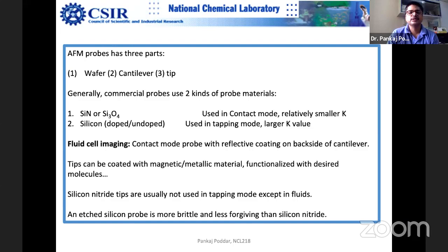As I told you, these probes are manufactured in silicon fab labs on large wafers. You know the wafers, silicon wafers you might have seen. They are circular discs and they come in different diameters. And on one side there is a linear cut, and you know the significance of that linear cut. It's not entirely curved from all sides. One side is basically a flat edge.